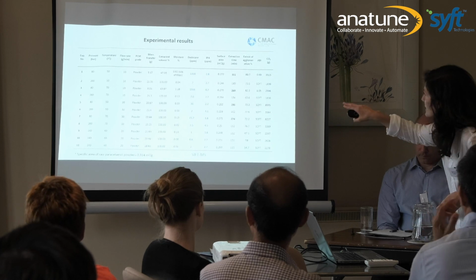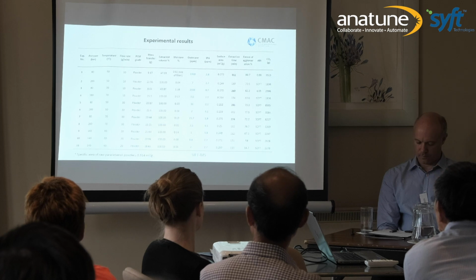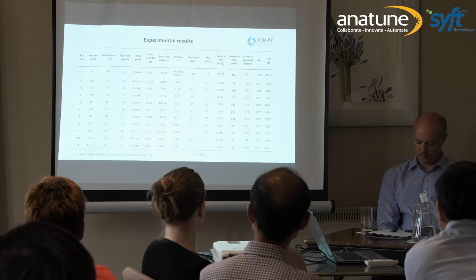There are highlighted rows that you cannot see, but we rejected the low conditions, the conditions that are close to the critical point, which correspond to 80 bar. These were rejected because we either had incomplete drying after 5 hours, or we had complete drying within 5 hours, but we spent a large amount of CO2, about 8 kilos.